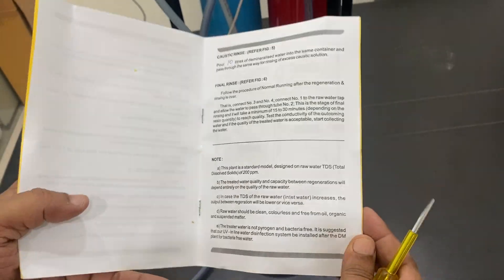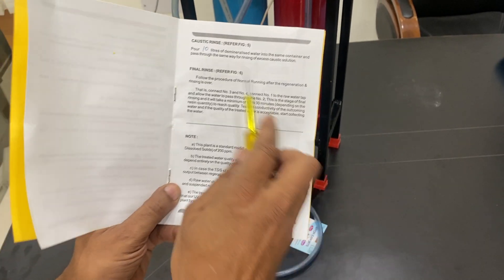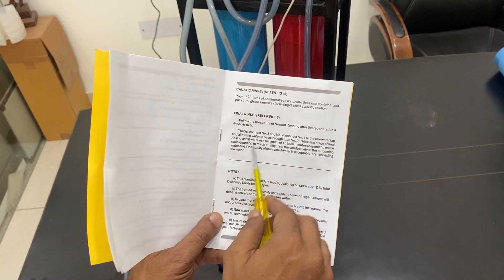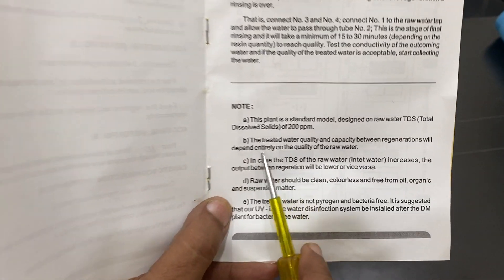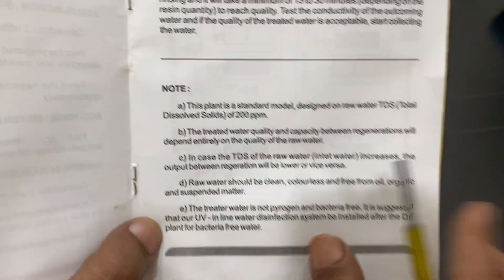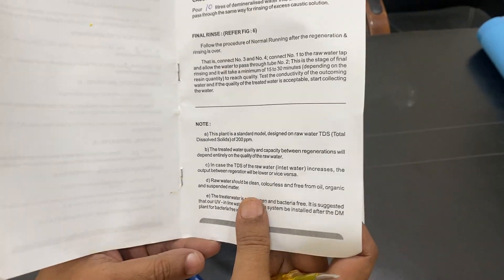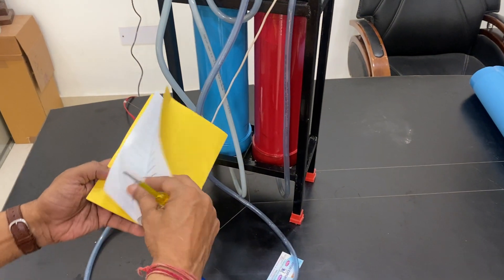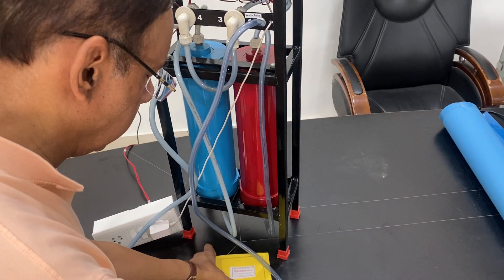The manual will come with the unit. You need to regenerate the resin after approximately 400 to 500 liters. The regeneration process uses caustic soda for one chamber and acid for the other. The TDS of treated water should be around 2 ppm.